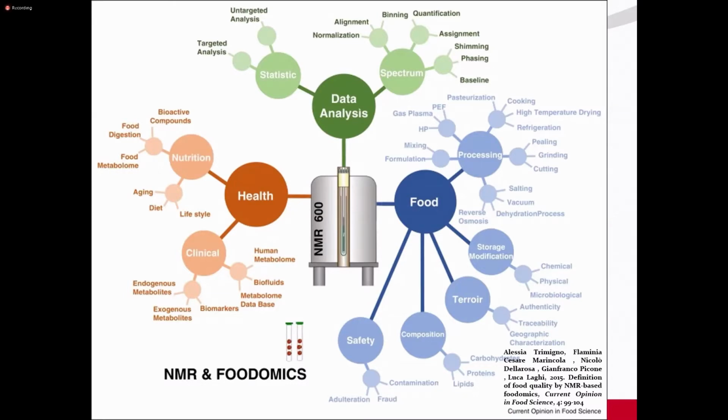Software is also capable of doing the data analysis on the NMR spectrum. You have to have insight into what the components of the spectrum are to make the interpretation correct.